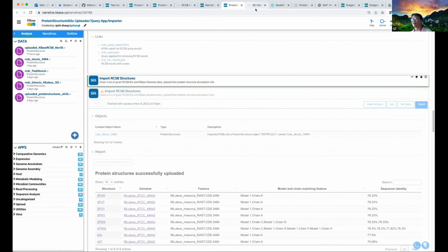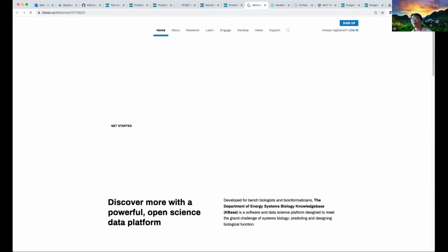I don't know why it always gets me to that. Welcome to KBase. Let me try one more time. It goes to the home page. Oh, because I didn't sign in.